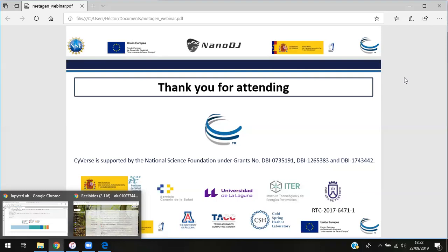My question is, what kinds of things are you working on in the future for NanoDJ? You alluded to them, but can you give us a little more of a teaser as to what's coming? Yes. So at first, we were working on genome assembly. You would have realized if you have been exploring the app that we have a couple of pipelines for genome assembly, but this was not the same for metagenomics. Now we are focusing on metagenomics, so we are learning new methods and evaluating them. This Kraken 2 notebook is an example of all of that.